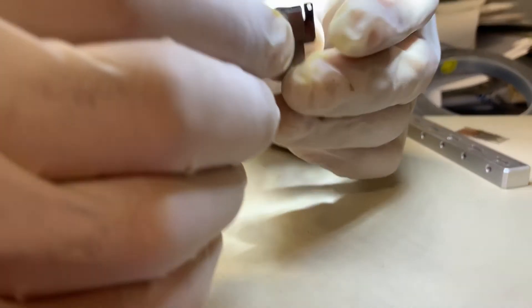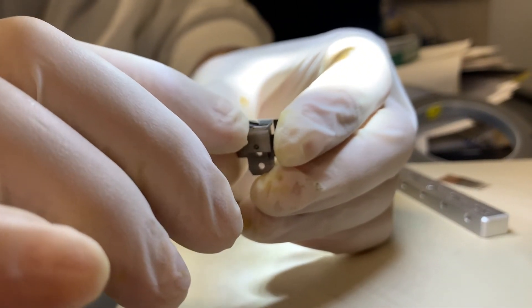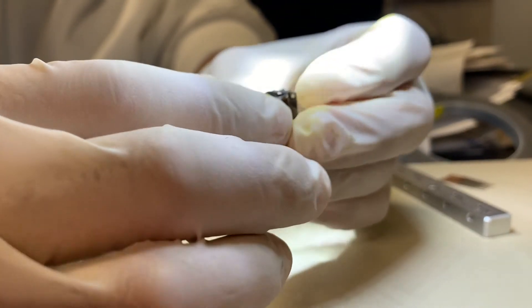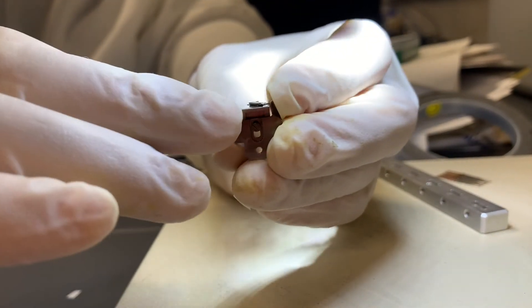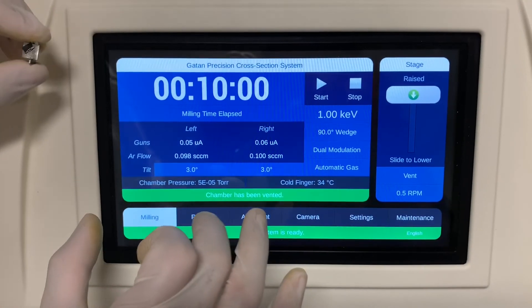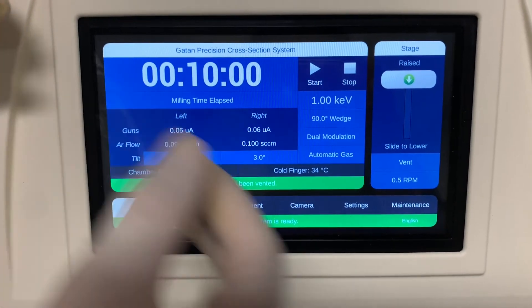Now you have created a surface where the sample surface, the stage, and the sample holder are all at the same height. Just put the sample in the machine and start it.